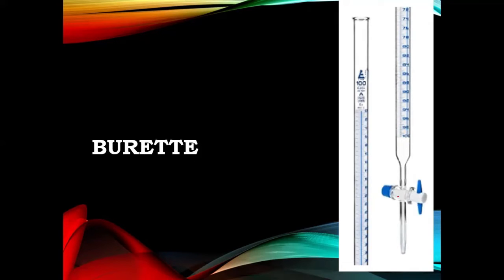The burette has either a tap or a pinch cock, and there is a very fine graduation. It is very accurate, and usually the burette that we use at Cambridge or intermediate level is of 50 ml, but a burette can be of 100 ml or more.